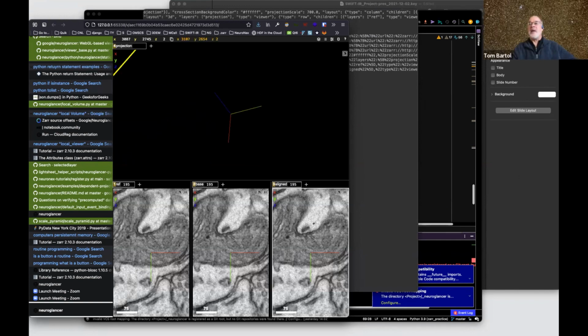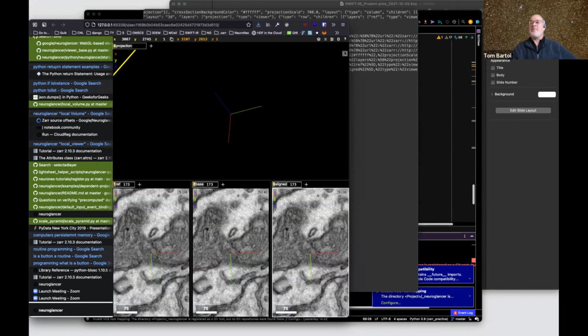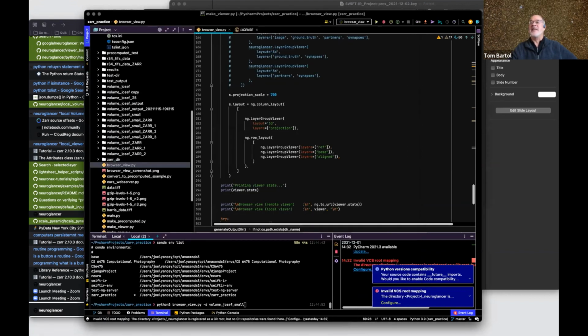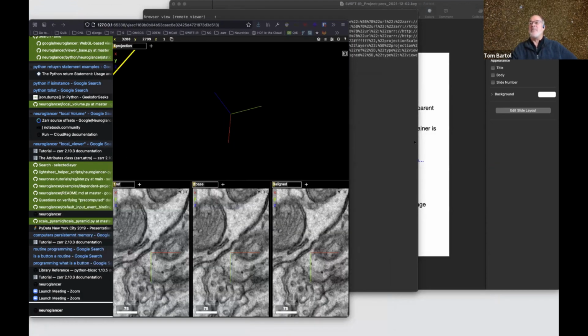Right. And Joel didn't point out, but one of the main reasons for needing to do this is because of the poor performance of displaying the large scale images in QT. And that's what the GUI is using right now. Yeah, QT is what the GUI is using right now. It's a GUI technology called QT.